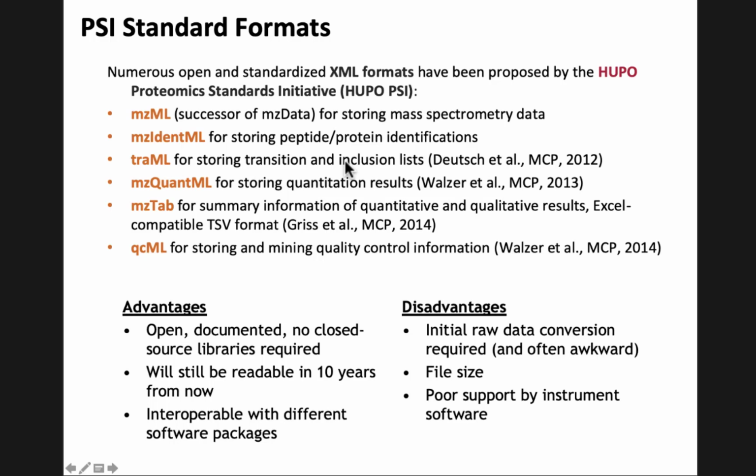Make it very easy to use these formats because they want you to stick to their own software, to their own formats. But it can be converted. We will show you how that can be done. And the advantage is that these formats you can actually use without the instrument vendor software.